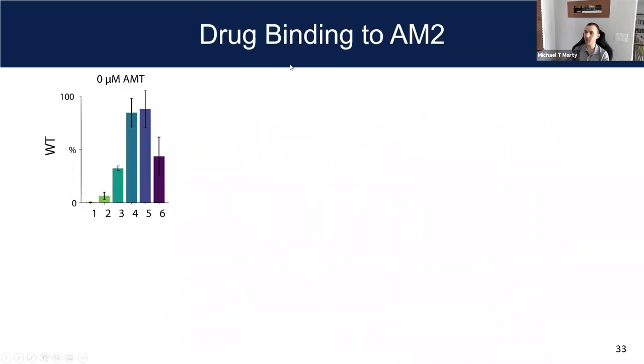So then we wanted to do drug binding. Unfortunately, for most of them we didn't see any evidence for drug binding. And I think the reason for that was that this is a very small drug, only 150 daltons, and there's not a lot of chemical contacts to hold it on.